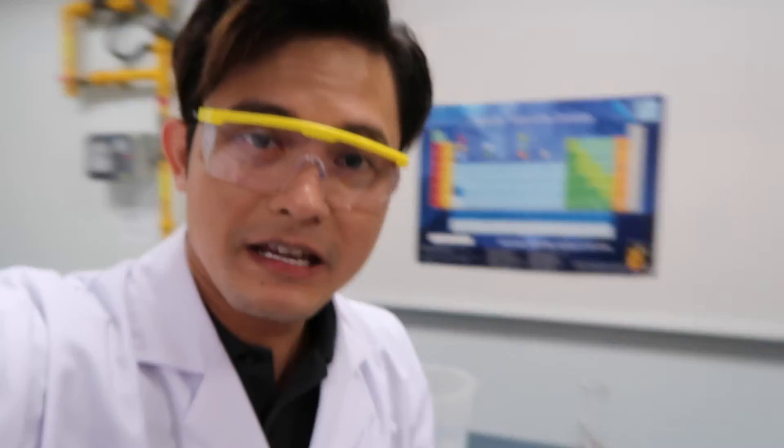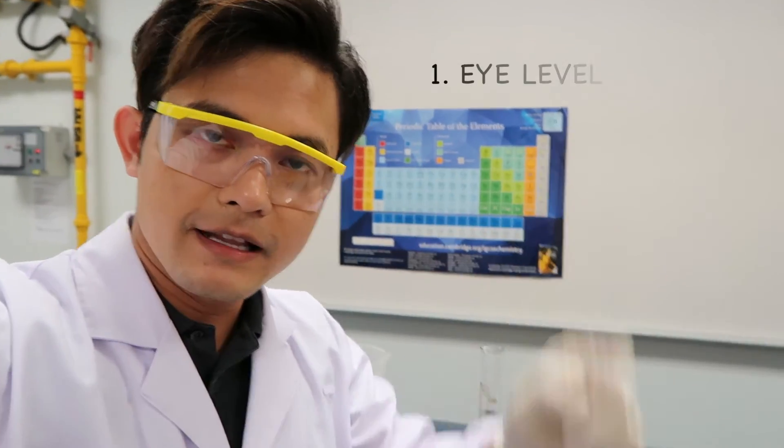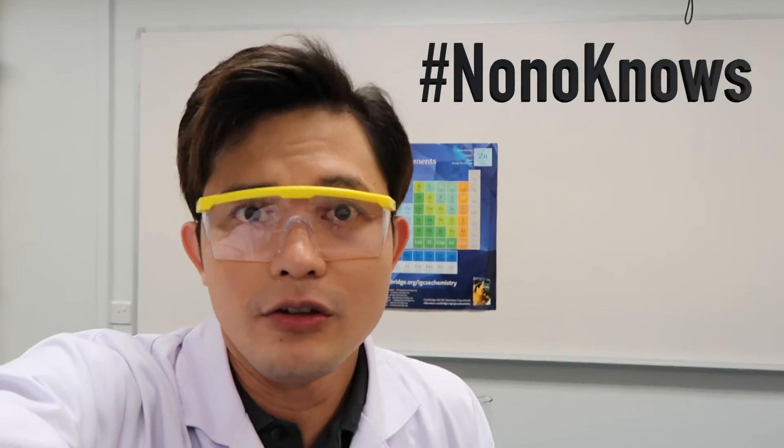So that's how you measure liquid in the measuring cylinder. Remember two things: eye level and measure at the lower or bottom part of the meniscus. So that's all folks. This is hashtag now you know. And now you know.